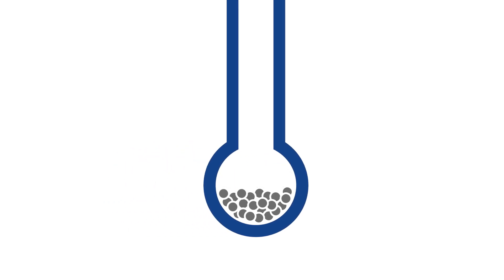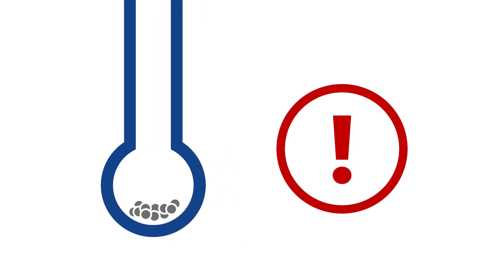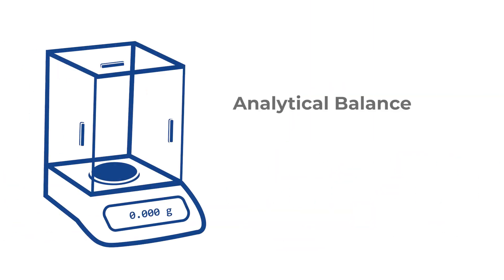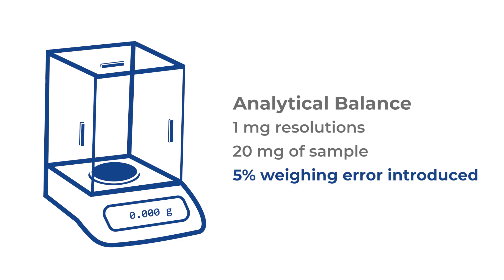What's the minimum mass of sample that can be used for an analysis? If the mass of sample size is too small, then it will be more susceptible to weighing errors. For example, there is an analytical balance with one milligram resolution and 20 milligrams of sample is being weighed on it. A 5% weighing error is already being introduced, so the balance resolution should be tailored properly to the sample mass.